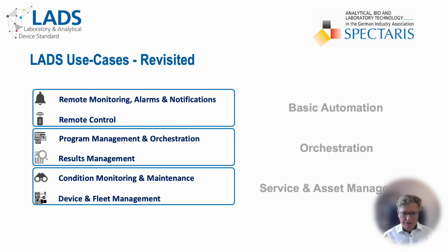When looking at the use cases we've defined, we must consider where we currently stand and what's needed to seamlessly integrate robots. It's great that we know the current state of the instruments, and remote control allows us to perform essential operations like opening a drawer and controlling programs.